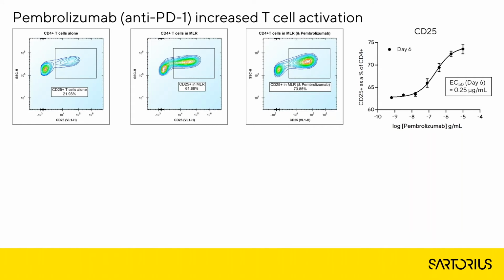This drug-induced increase in the T cell activation is not as pronounced as the threefold increase we initially saw due to the addition of DCs, but this might not be surprising and may actually reflect the clinical situation in that the aim of the checkpoint inhibitor is to delicately tip the balance towards enhanced T cell activation rather than to overactivate the T cell response.